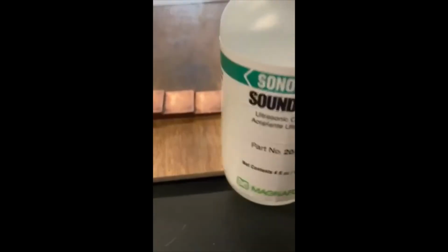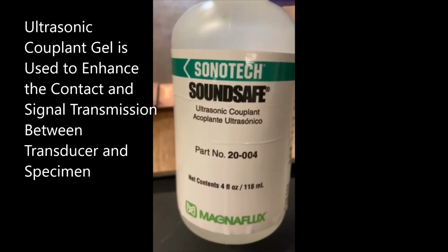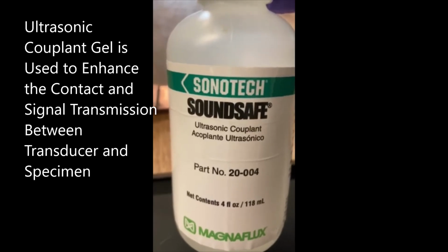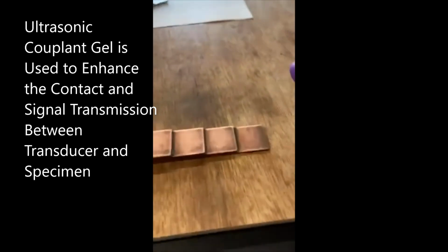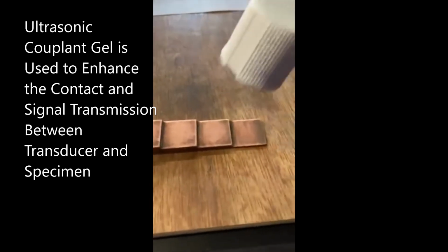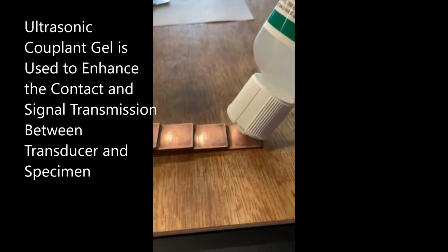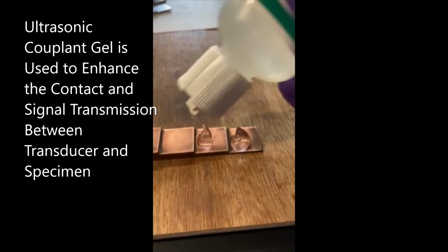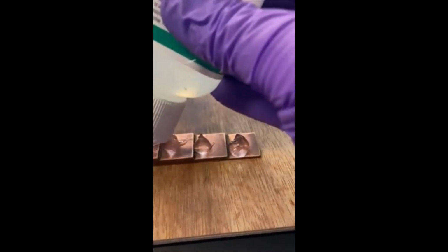The Panametrics pulsing unit is configured to operate the transducer in both transmission and receiving mode. In other words, we're going to use it to generate the pulse, where we apply a voltage across the crystal to make it change its shape. And then we're going to allow the pulse, upon return to the transducer, to compress the transducer and convert the compressing of the transducer into an electrical pulse.